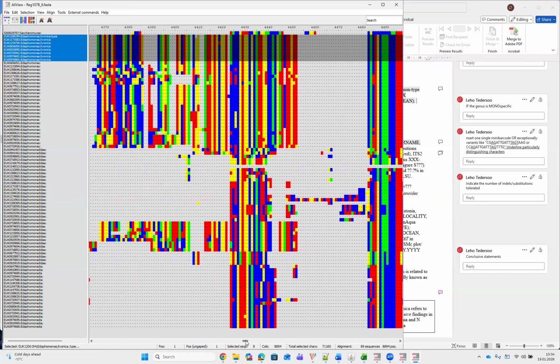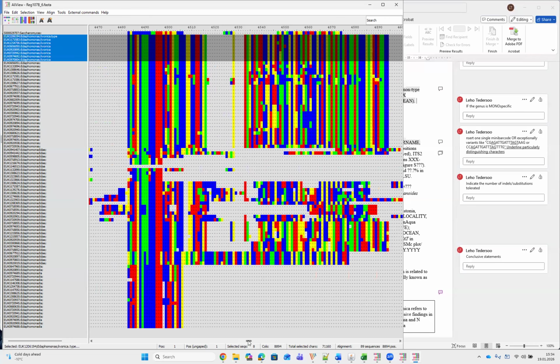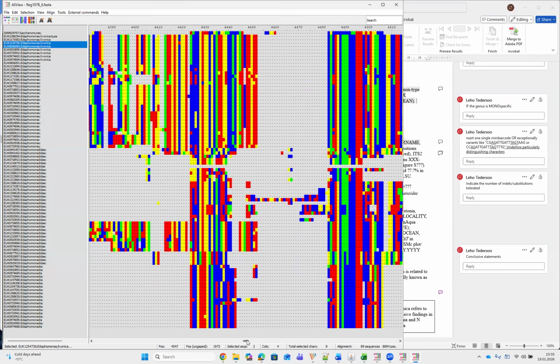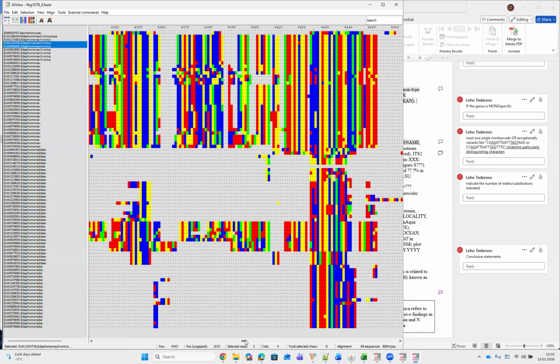Here we see that it's not a very easy task because the sequences are either very different or very similar, and in some cases there are also single nucleotide differences within the target species itself. So these places we have to ignore because these are not suitable for our purpose. So let's try to find this place in some most variable region.